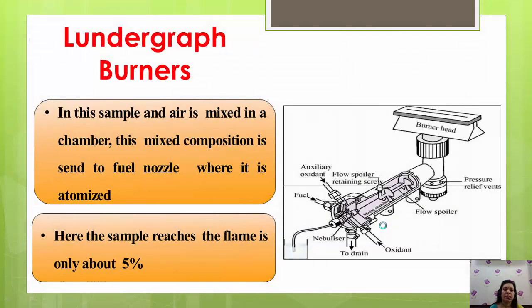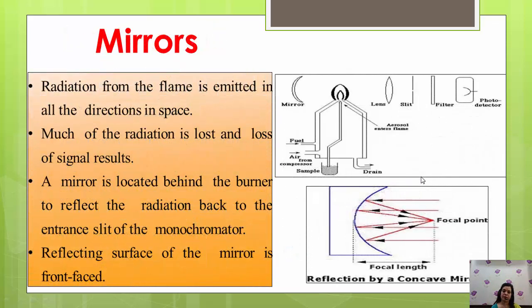Lundegardh burner. In this, the sample and air are mixed in a chamber. This mixed composition is allowed to flow through the burner head. Here also utilization of the sample is very less. Now we move to the next component, that is the mirror.